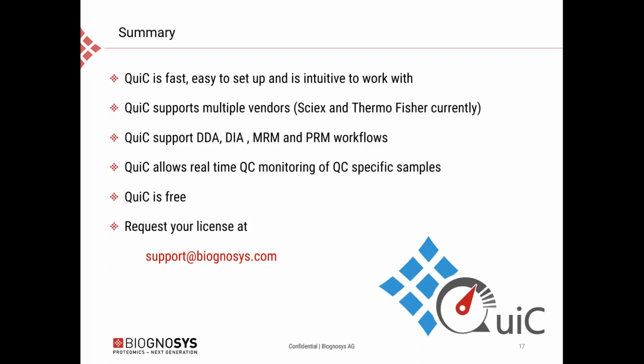The next question is, on what level do you recommend performing your QC analysis? Here at Biognosys we perform QC on several levels, as Florian already indicated before. We typically perform a quality control run before and after instrument maintenance. We also perform quality control in special QC runs within an experiment, especially if it's a very large experiment. If it's dozens or hundreds of runs, we do that.